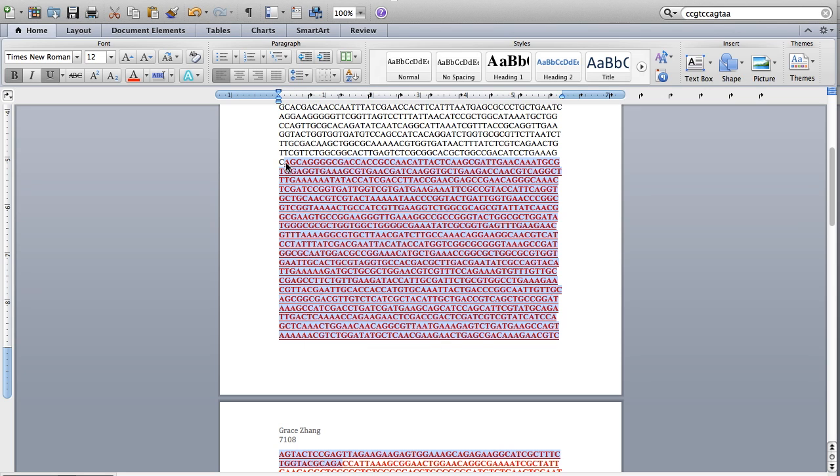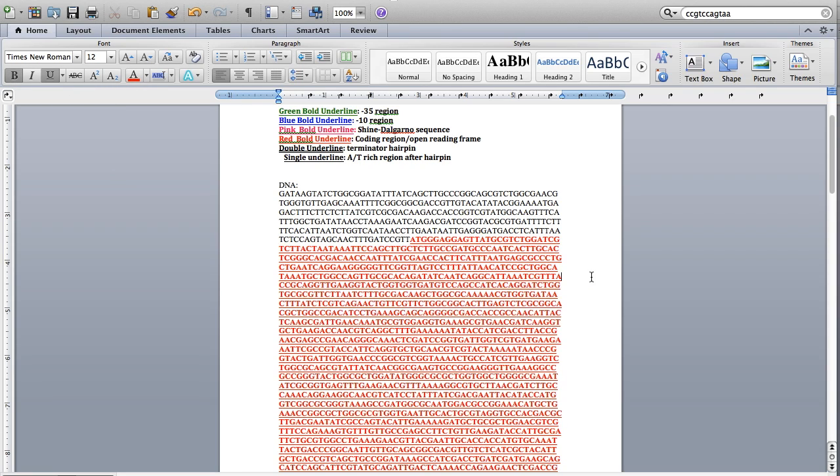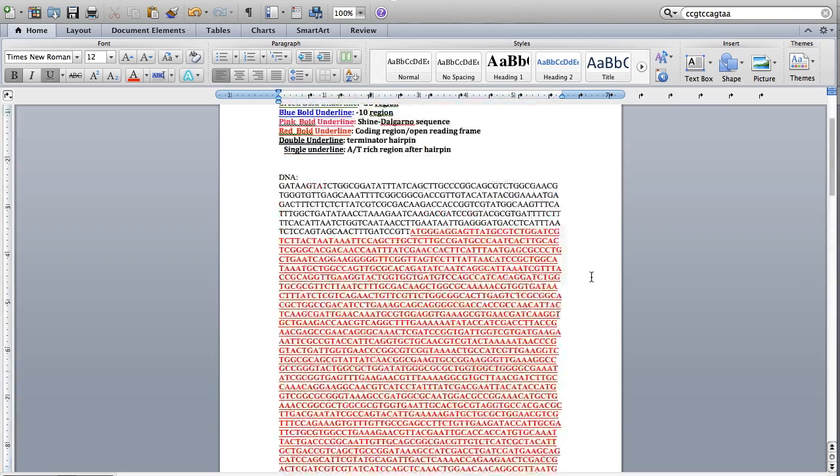Okay. Almost there. Okay. All right. And there we have it, our coding region.